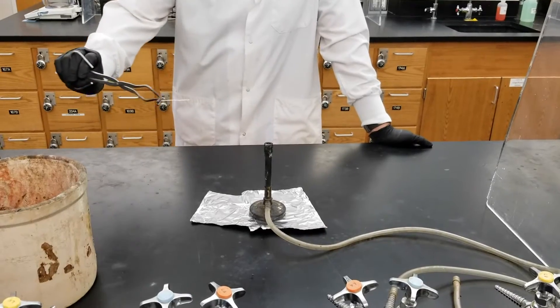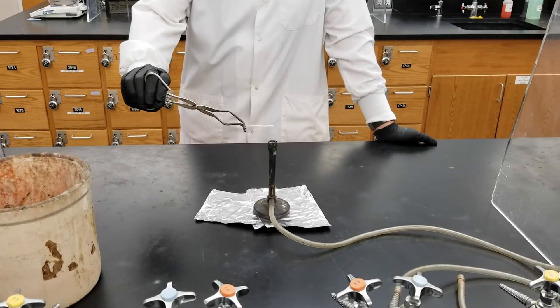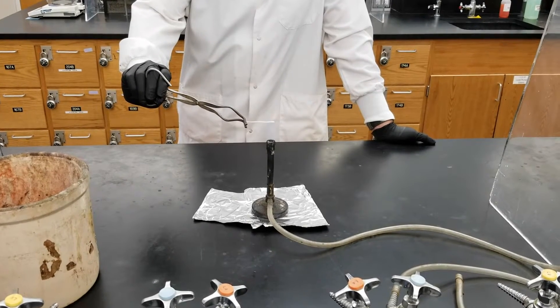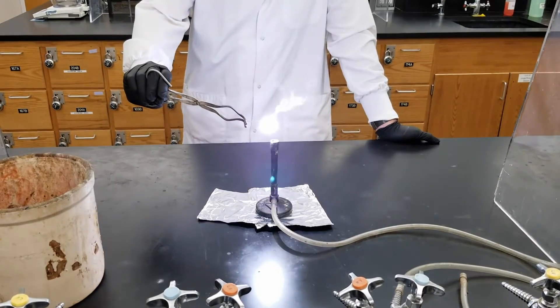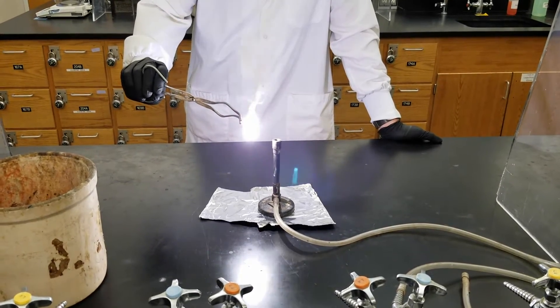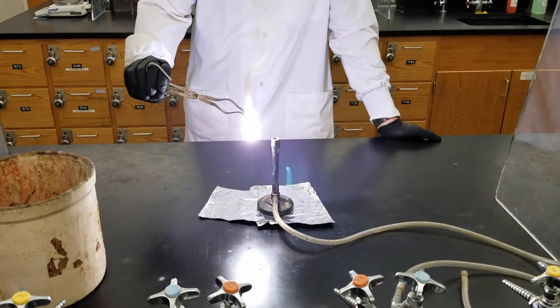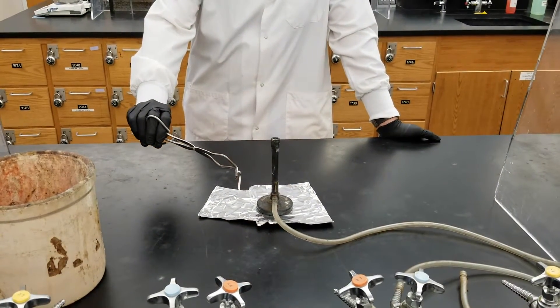Now I'm going to tell you about each of the different tests that you'll perform. The first test is burning a piece of magnesium ribbon. As you can see this will create a very bright flame that can permanently damage your eyes if you look directly at it. So you have to look to the side or avoid looking directly at the flame.